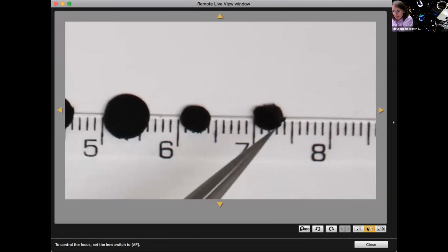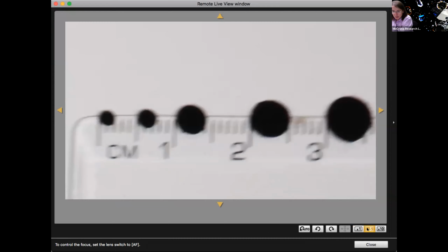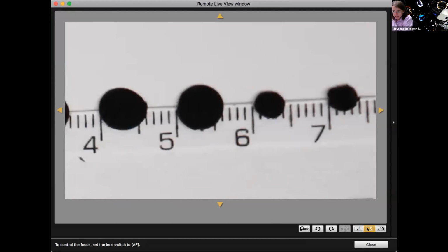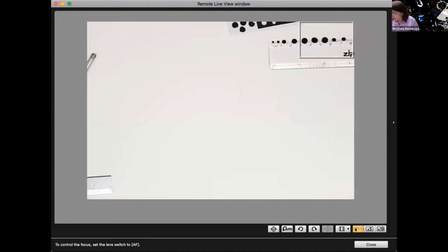And this one ended up being round about 4 millimeters. I have some that are certainly larger and some that are smaller. So you want to make a selection to see what works best. So if I'm making one of these, I have a spot ready to go. But the next thing is that I'm going to need to get my objective ready.